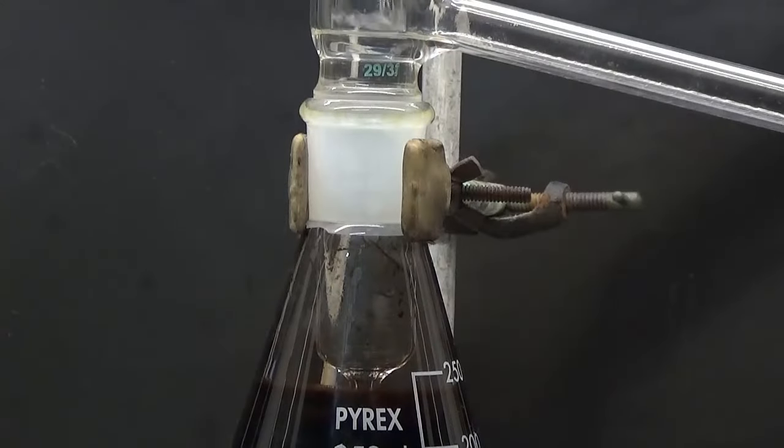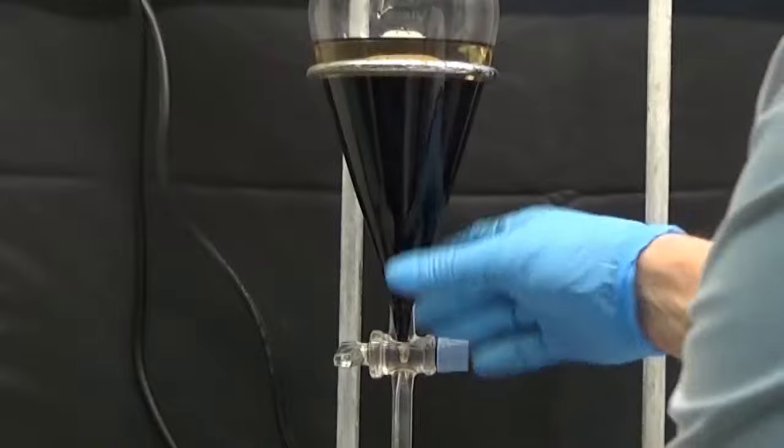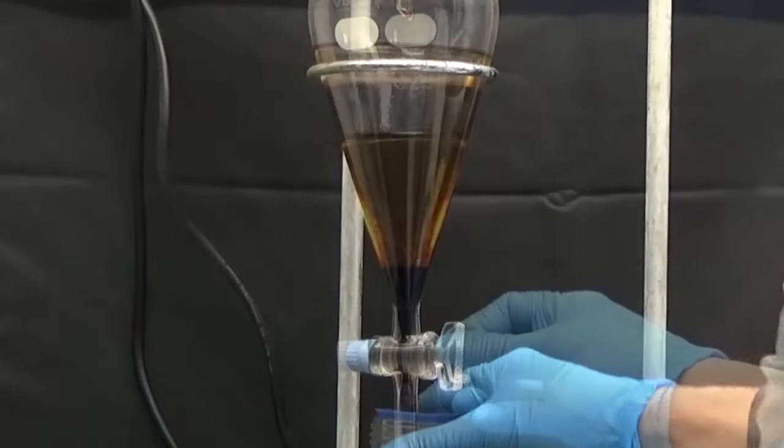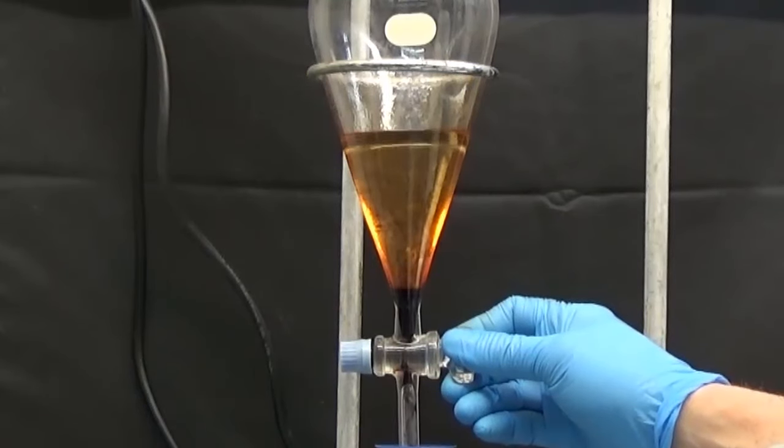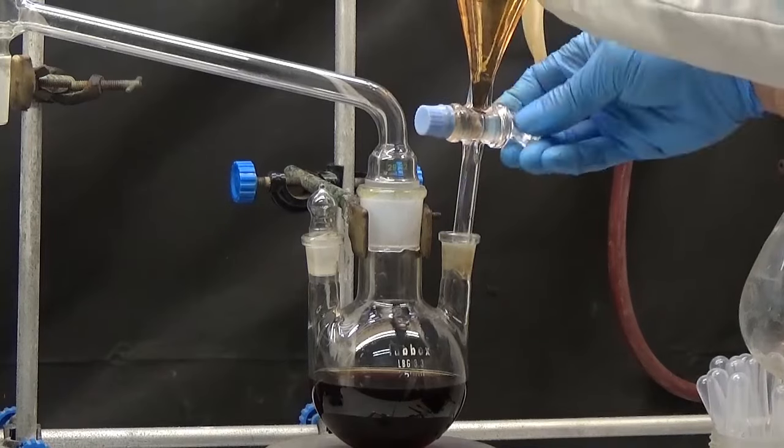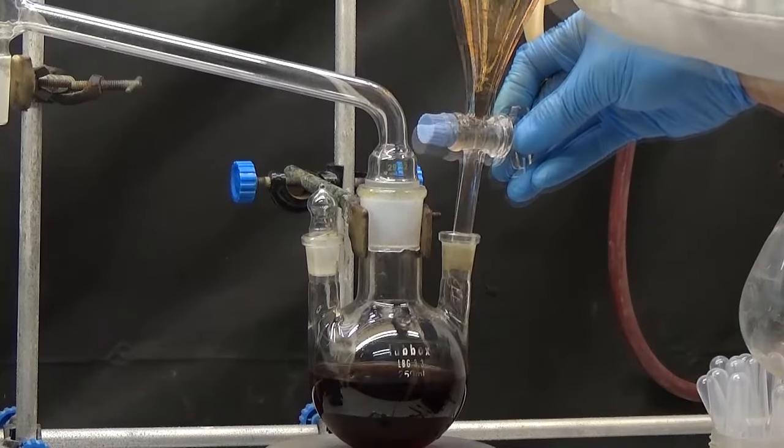The operation is complete when the ether is completely clear. All the product of the Erlenmeyer flask is placed in a separatory funnel and the organic phase is separated. The organic phase is added to the one of the evaporation balloon and a thermometer is fixed.